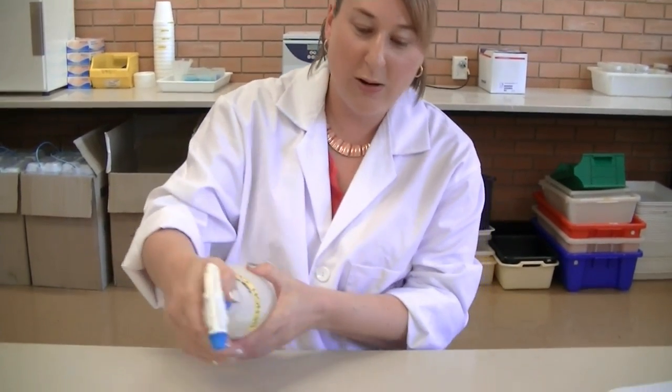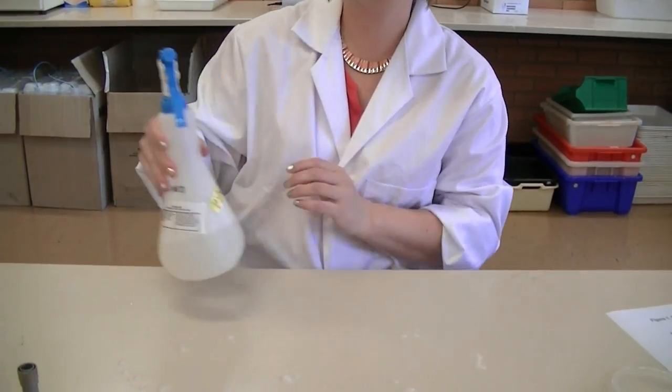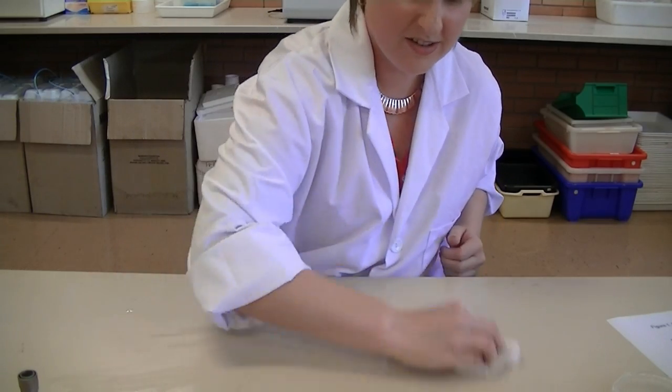You must also wipe the bench down just in case any of the culture was spilt or accidentally flicked onto the bench surface when you were working there.